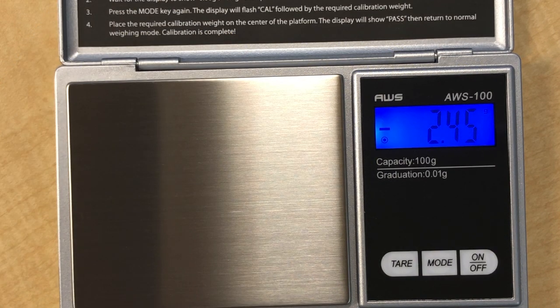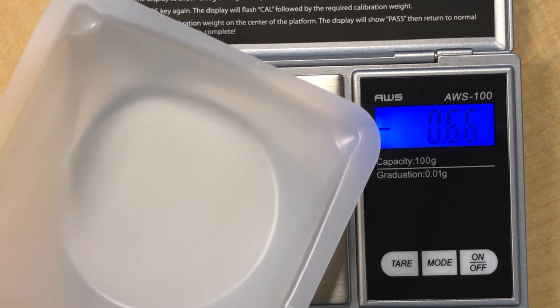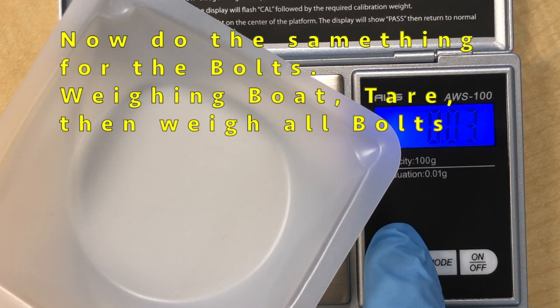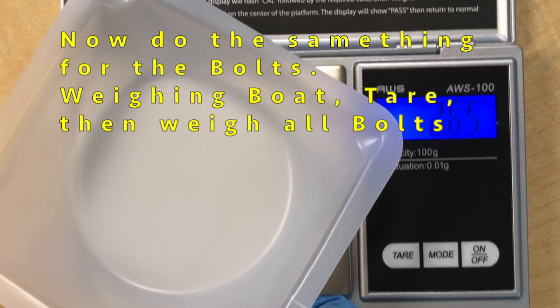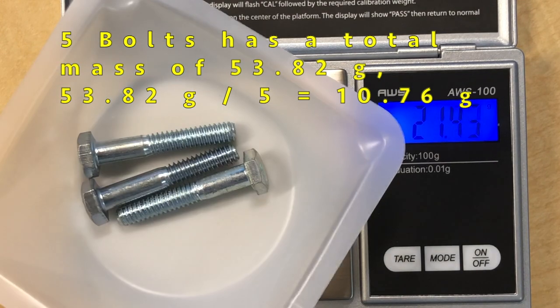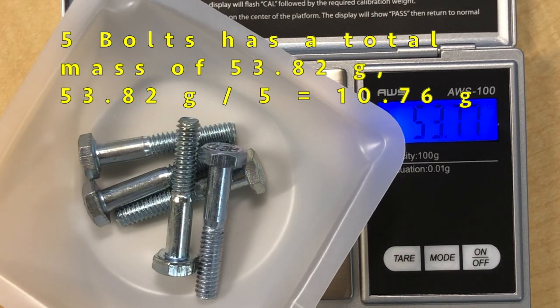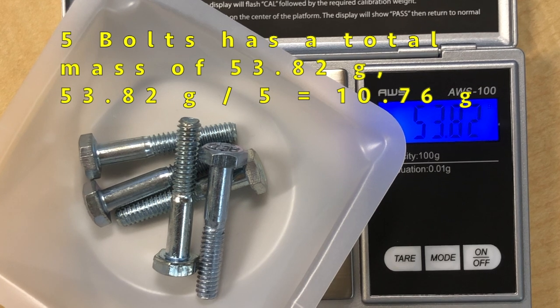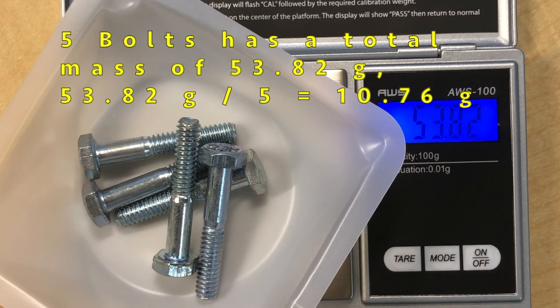Next, place the weighing bolt again on the scale, make sure you tare it so it reads zero, then put all your bolts. Here we have five bolts and the mass of the five bolts is 53.82 grams. Taking 53.82 divided by five gives 10.764 grams per bolt.